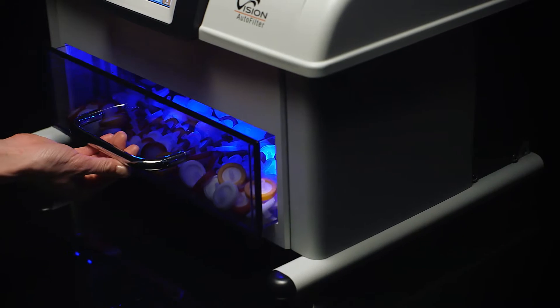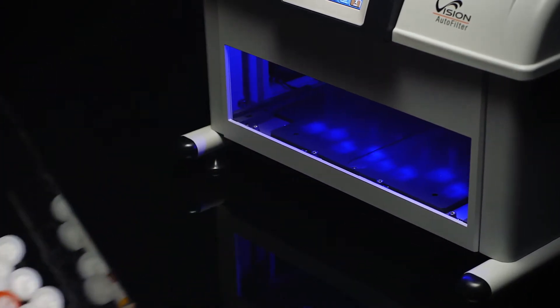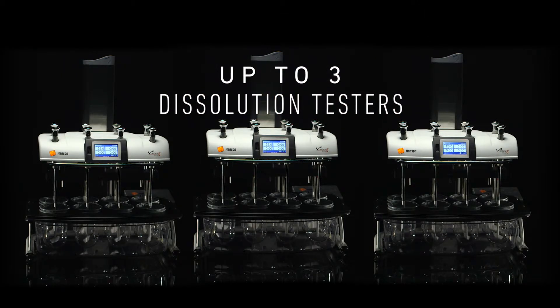The catch bin drawer's transparent face enables a quick visual check of the contents. When the drawer is full, simply remove it to throw out discarded filters. The Vision Auto Filter Changer is compatible with up to three Hanson Vision dissolution testers.